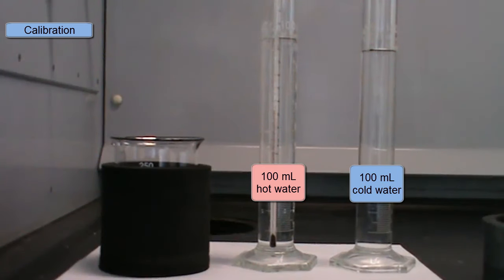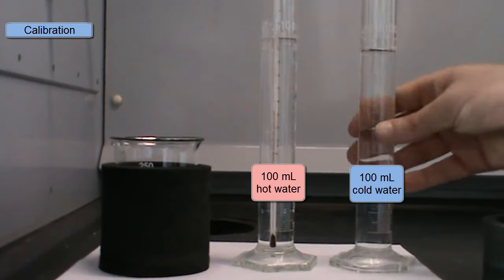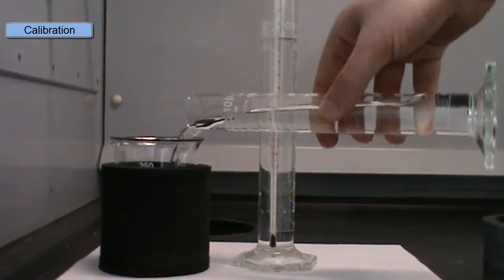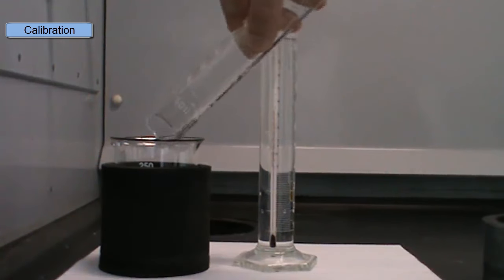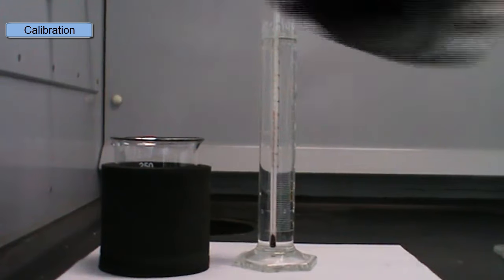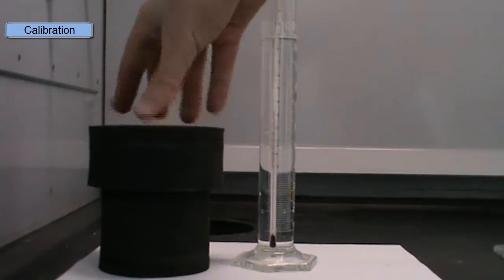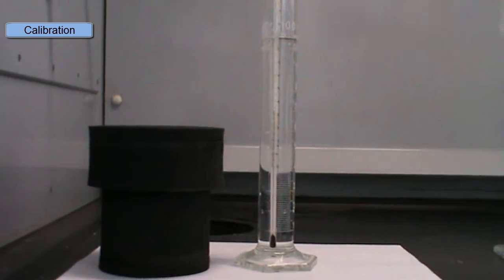So in the calibration step we'll take 100 ml of hot water and 100 ml of cold water. We'll add the cold water into the calorimeter, put on the lid and measure its temperature. So we'll put in our thermometer and we'll measure the temperature. This is the temperature of the cold water.